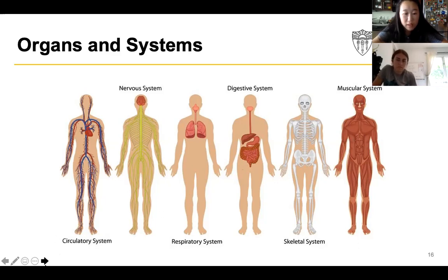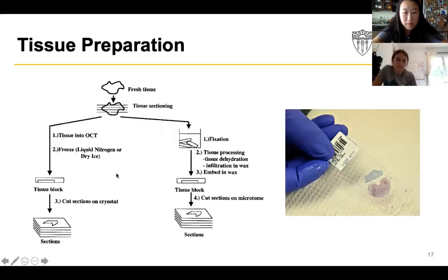So looking at all of these, histology comes in when we're actually trying to see it in more detail. The tools for studying histology are becoming more diverse every day. And the most common tool for examining cells, tissues, and organs is optical. Like Nina mentioned earlier, everything to do with microscopy and actually using light to visualize it.